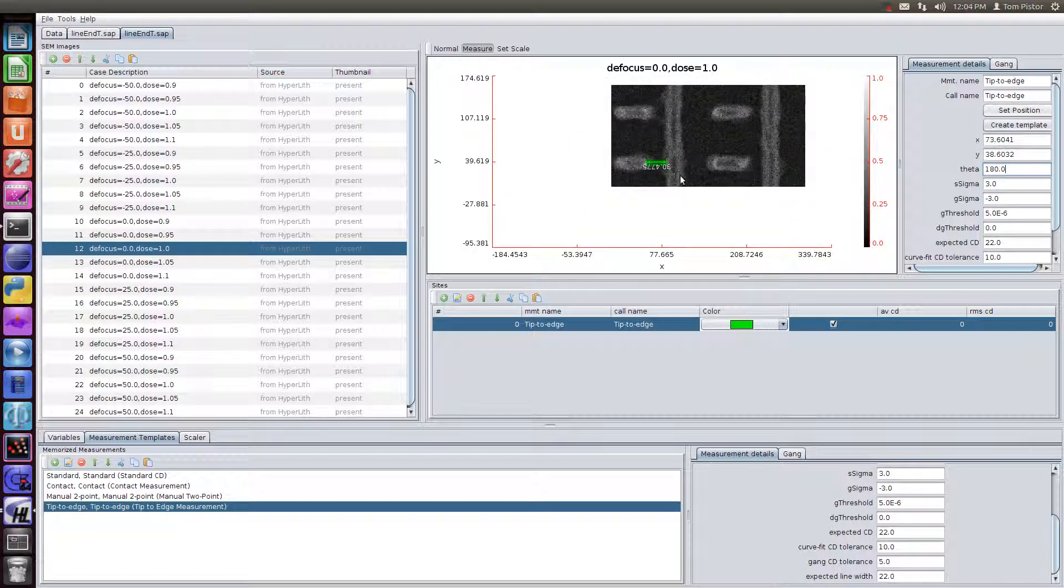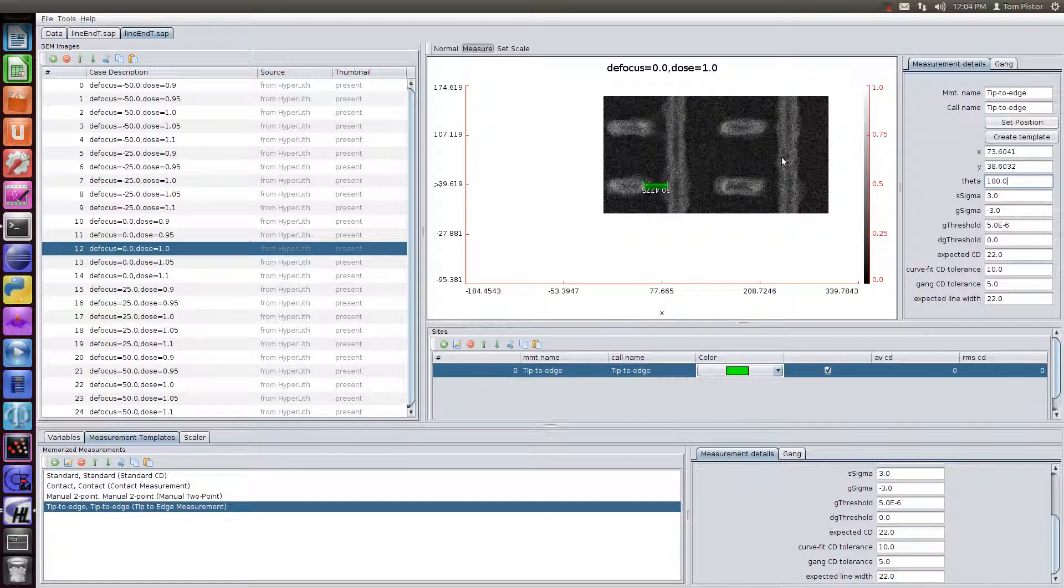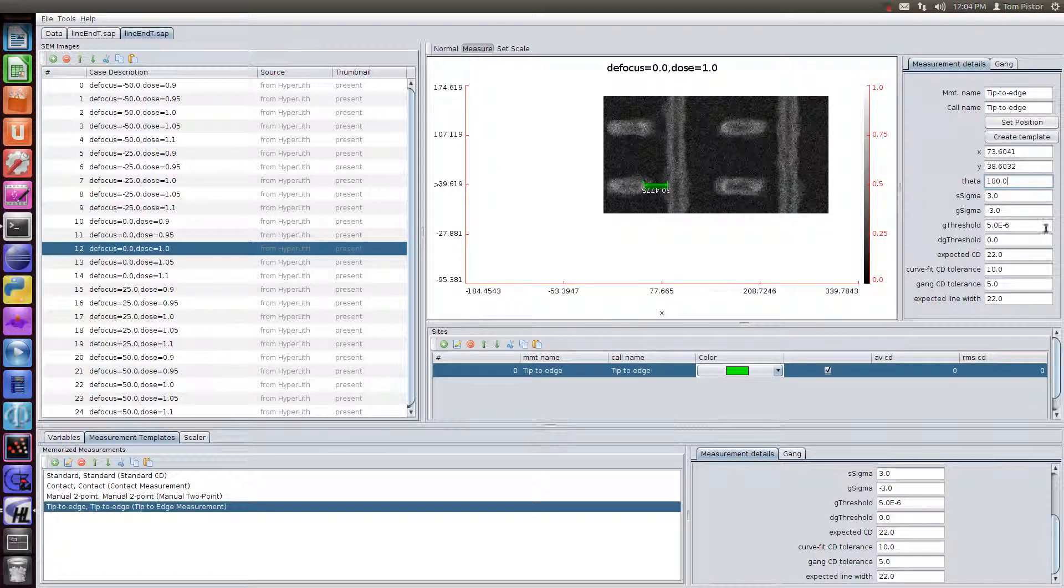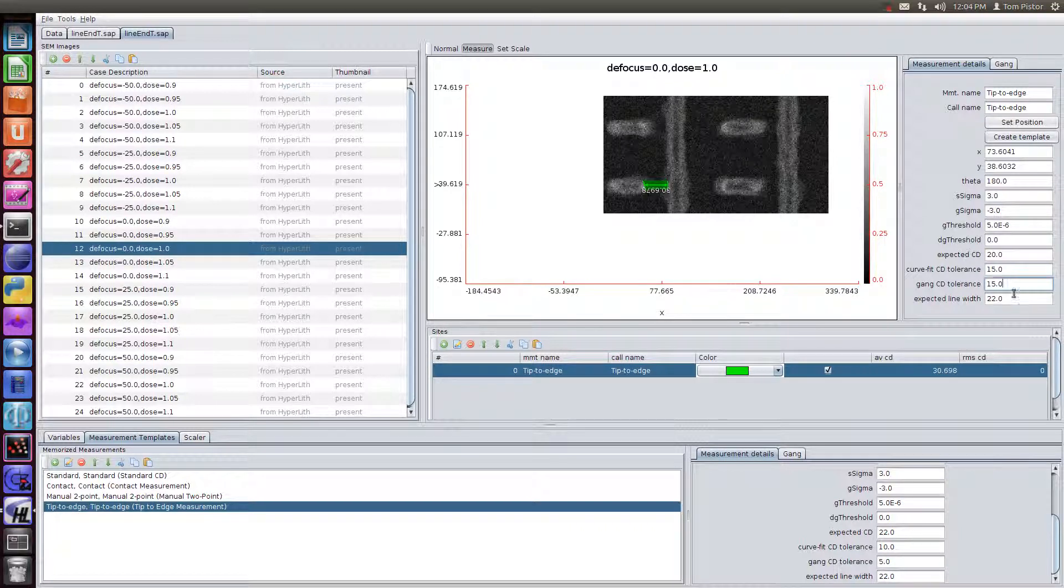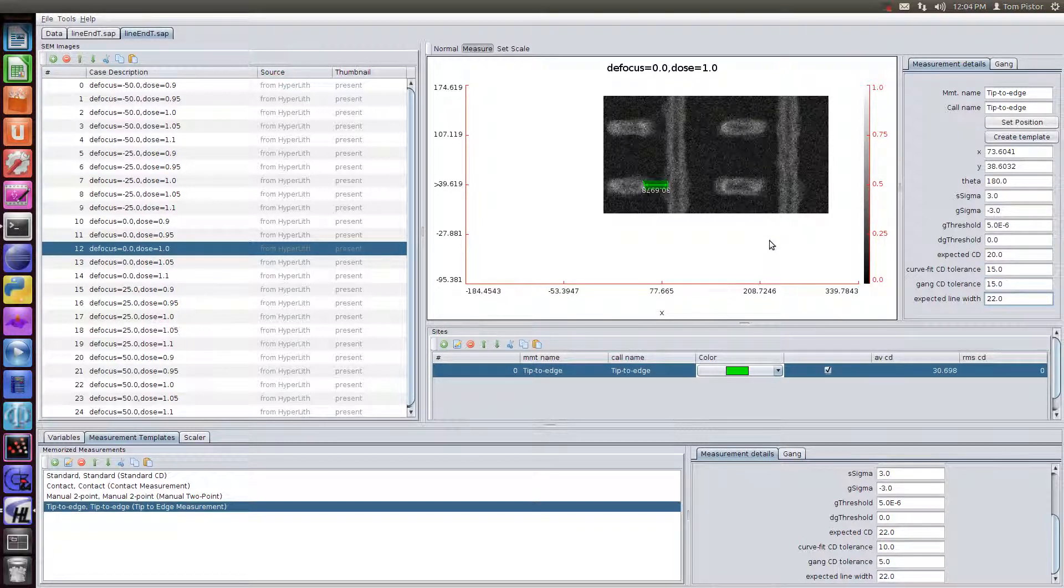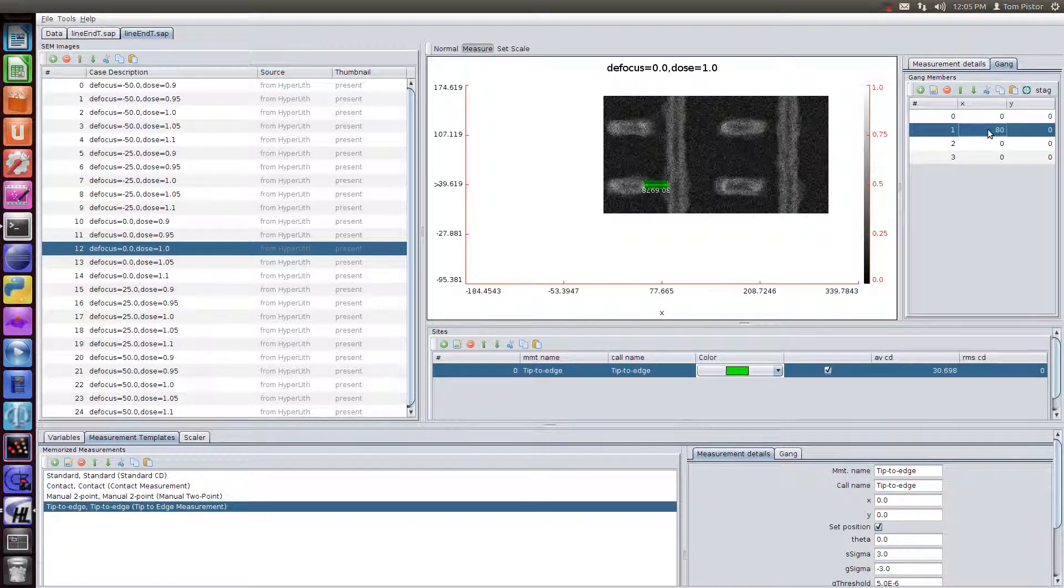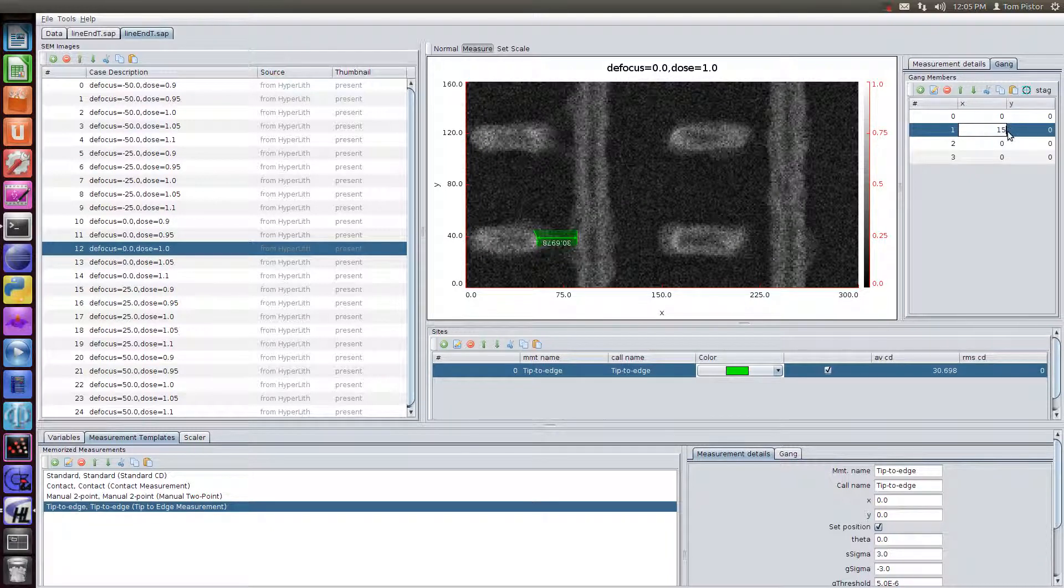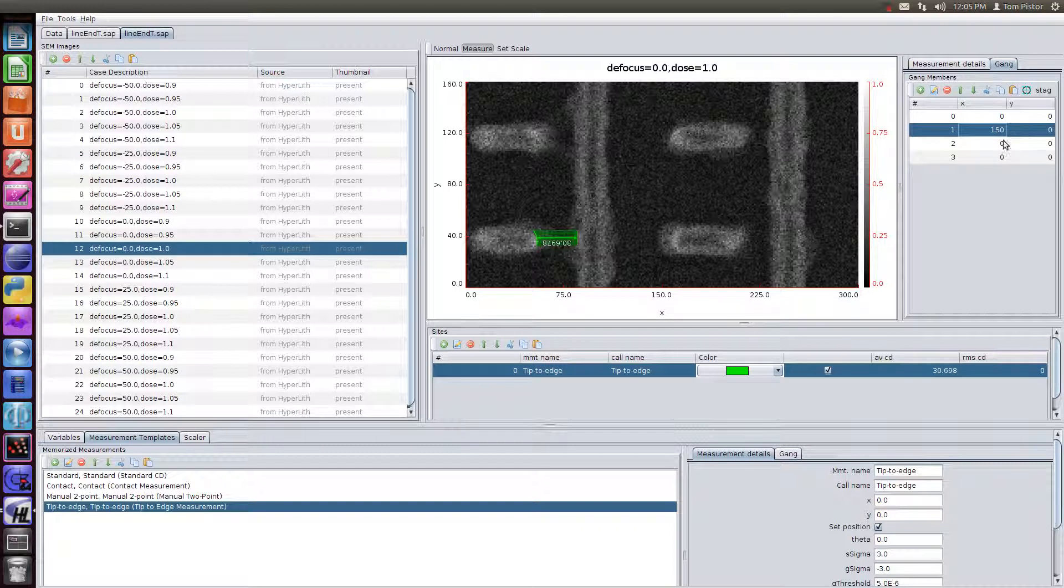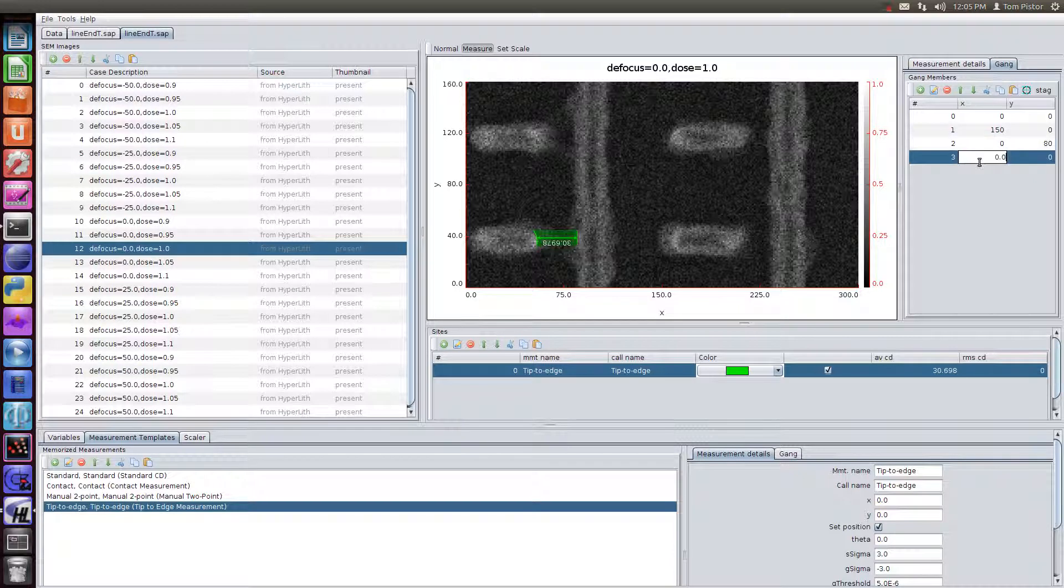And the thing is, we have four instances of this pattern. And we can get RMS info if we measure in all those four places. So there's a few other things we need to set here. So the expected CD is around 20. I'm going to have a curve fit tolerance and a gang tolerance. And then we're going to set the gang. So right now, this is one measurement. And then the gang is, we're going to add three more. So this should be at 150. So the first one is 150 over to the right. Then the next one would be 80 up. And then 150 and 80.